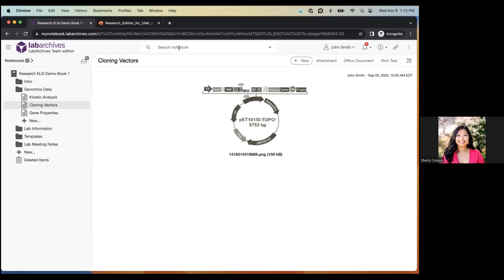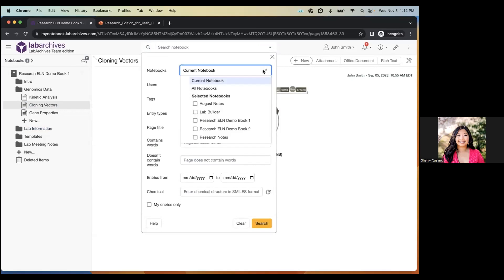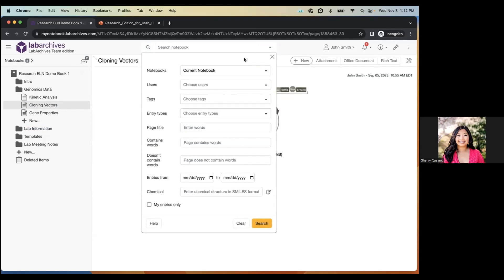Up at the top is a search bar where you can do a simple search or click the upside-down triangle for advanced search. Advanced search lets you refine your search criteria and, importantly, select which notebook to search — the current notebook, all notebooks, or selected notebooks. So you're not limited to searching within just one notebook; you can have data spread across multiple notebooks and still search everything.